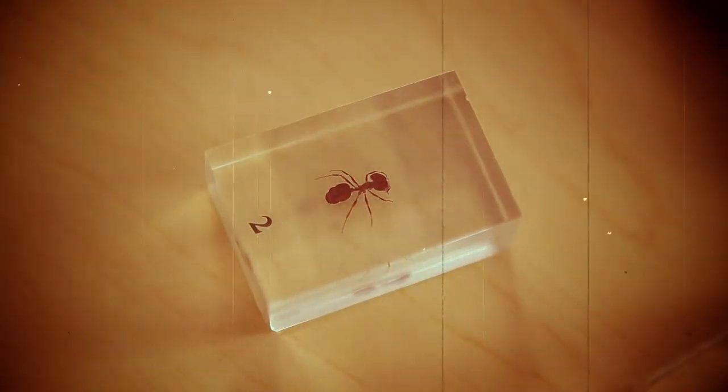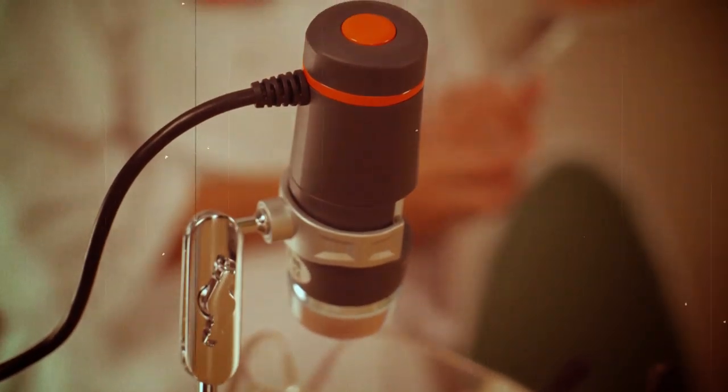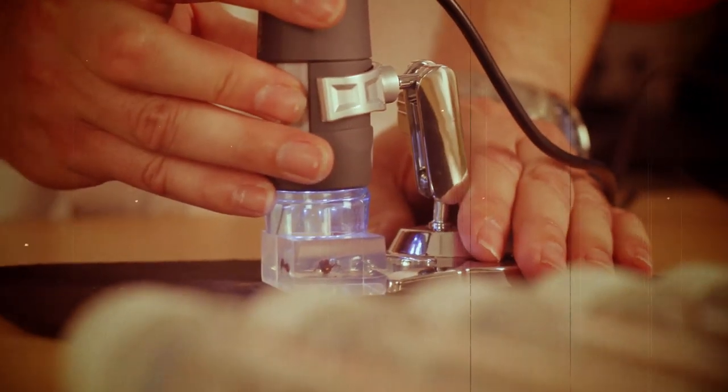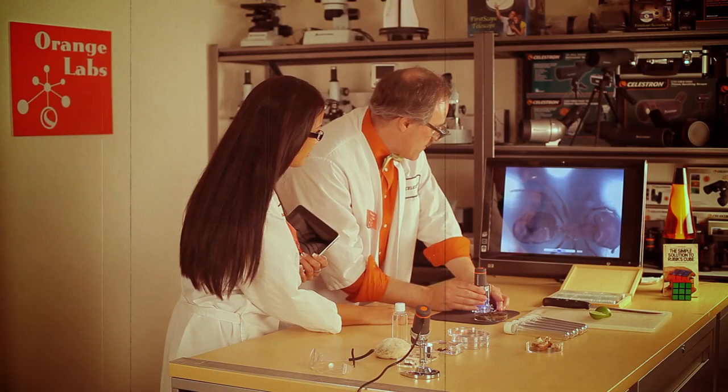You can take pictures of ants, dirt, mushrooms, fungi, and all kinds of things. It allows me to take pictures and make measurements — we can even do science. It's like a webcam that magnifies things? Yes, exactly. You can take pictures of bacteria, microorganisms, spiders, ants, and tomatoes. It has a 1.3 megapixel camera, and three different magnifications: 10, 40, and 150 powers. I would be the envy of the entire science community. With that, I can view things at all kinds of different scales.